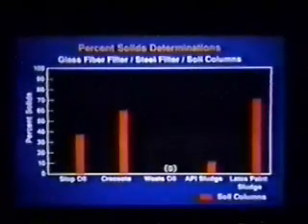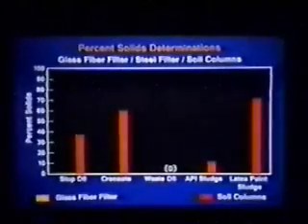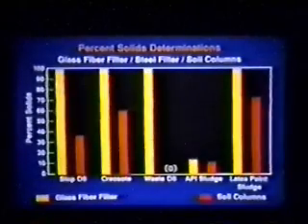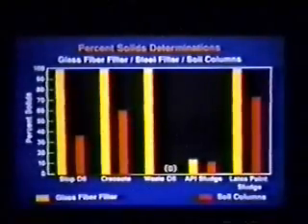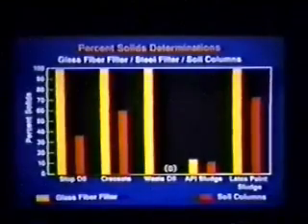First of all, by conducting our soil column experiments, we've provided some new information on how oily wastes actually move in soils and how the waste constituents may be released to contaminate groundwater if they're improperly disposed. Second, by comparing the results of these column experiments with the existing method 1311, we demonstrated that that procedure is not adequate for oily wastes and other difficult to filter wastes.